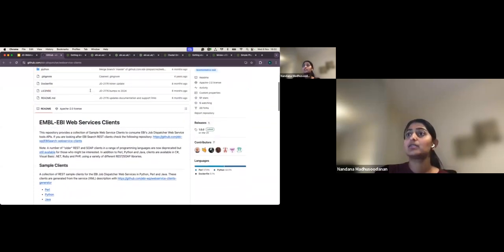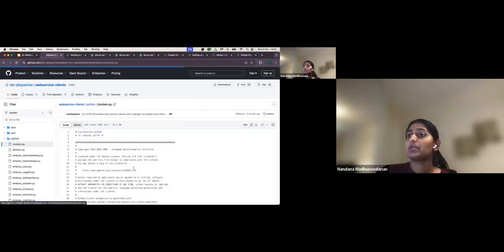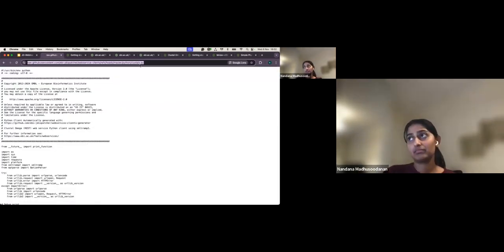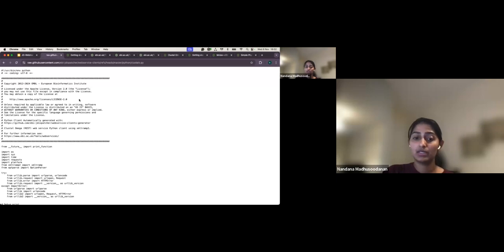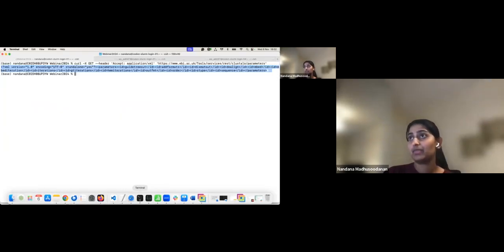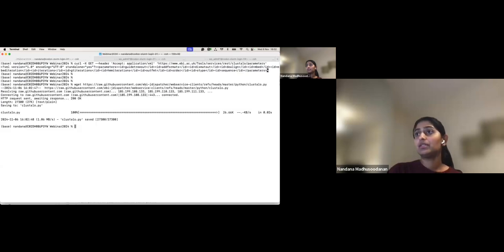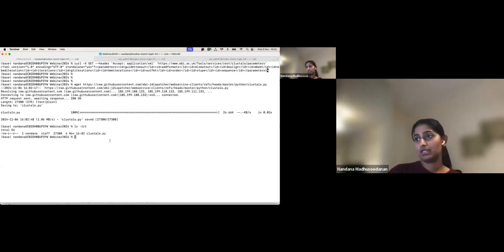I'm downloading the clustalo.py file using a wget command. If you're using multiple tools, you can also clone the entire repository with git clone. In this case I'm just downloading the single file. Now I have the clustalo.py file.